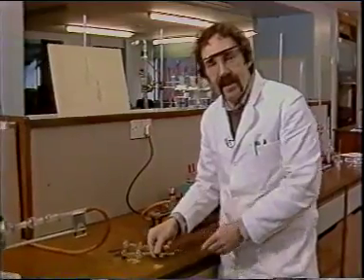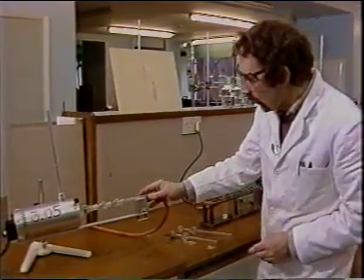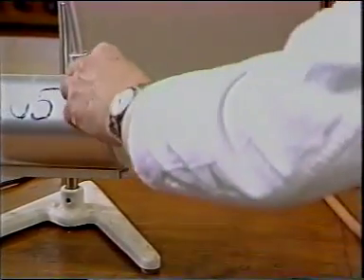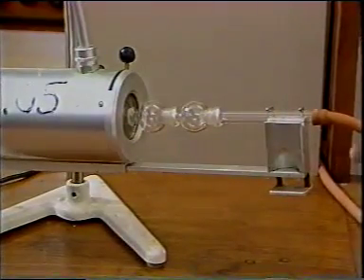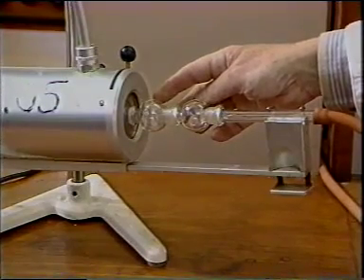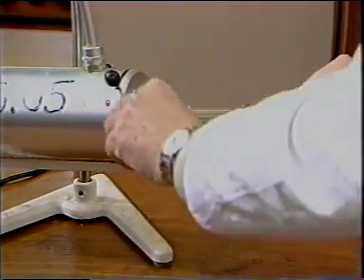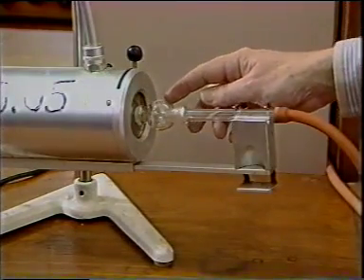There's even a commercial apparatus for doing this job called the Kugelrohr. Our impure liquid is placed in this flask, which is then inserted into the furnace. Suction is applied here, and liquid distills into this second bulb. We can carry out a further distillation, if we require, by moving this second bulb into the furnace and redistilling into this third bulb.